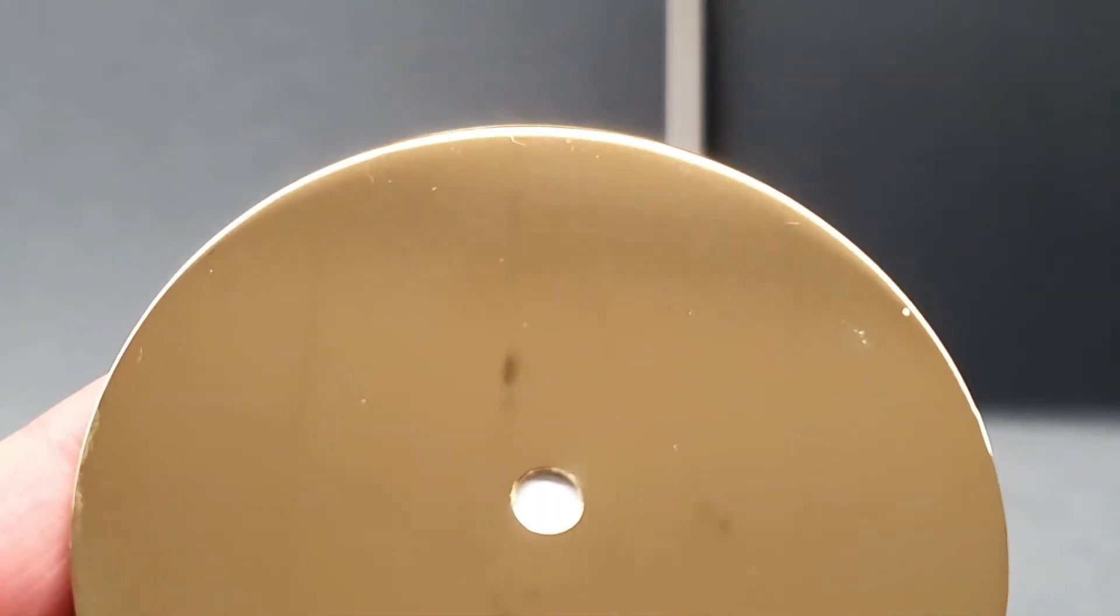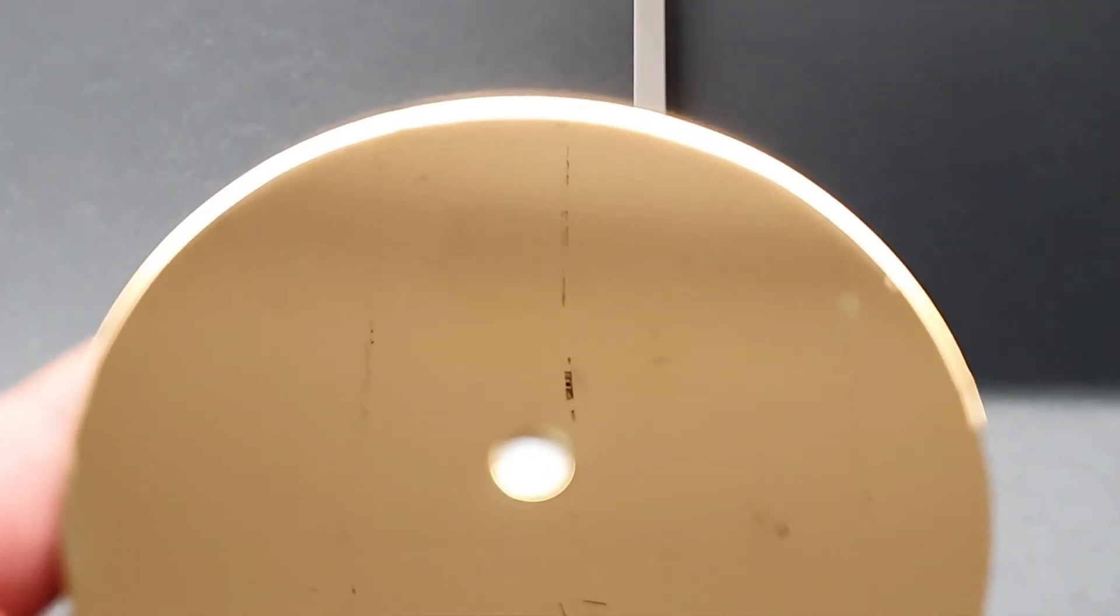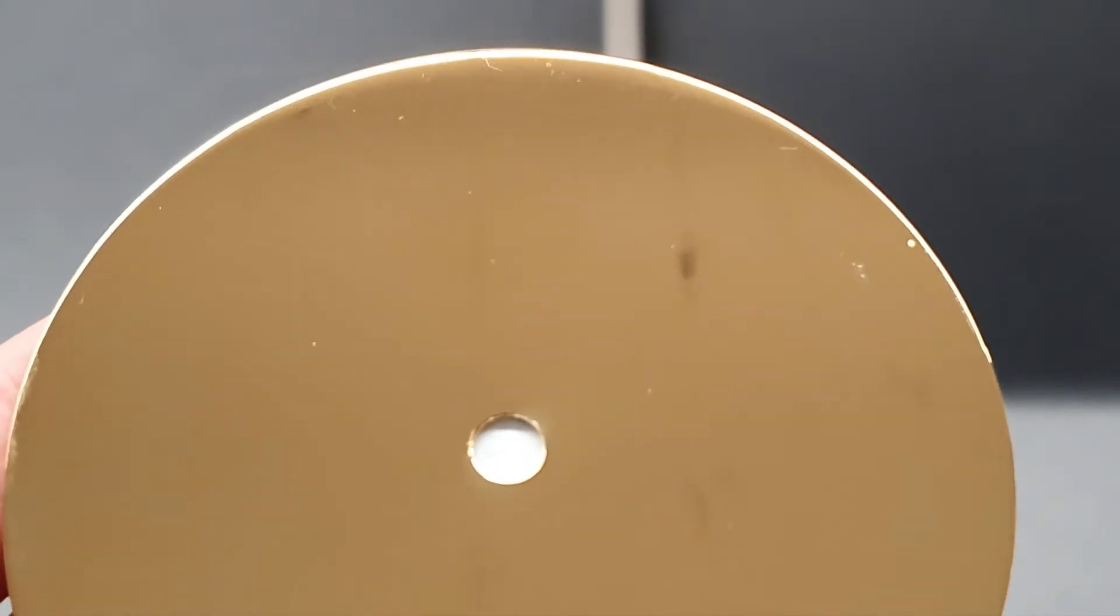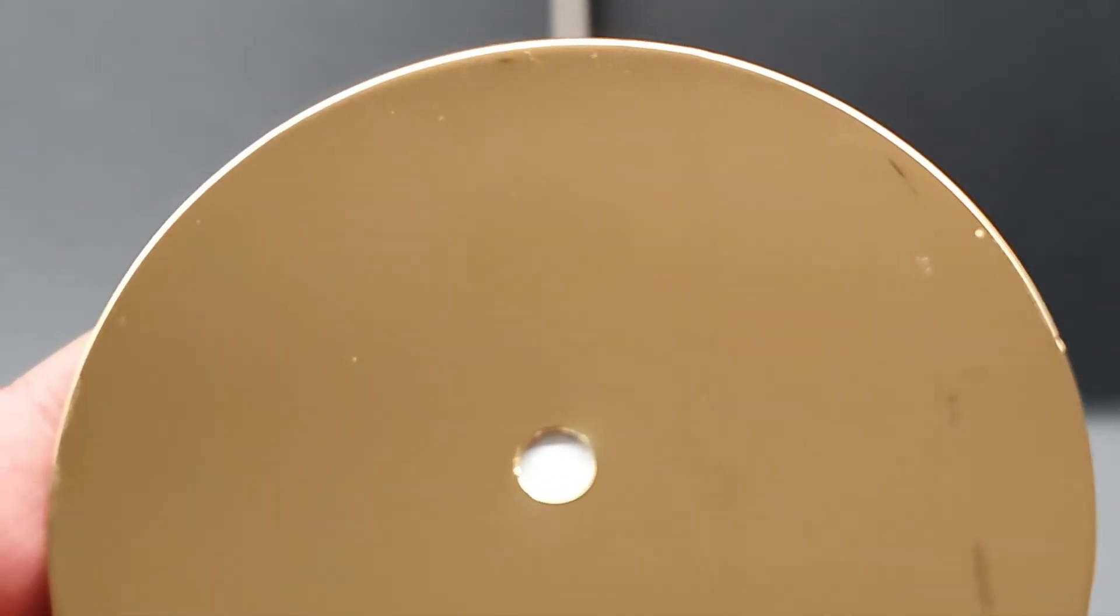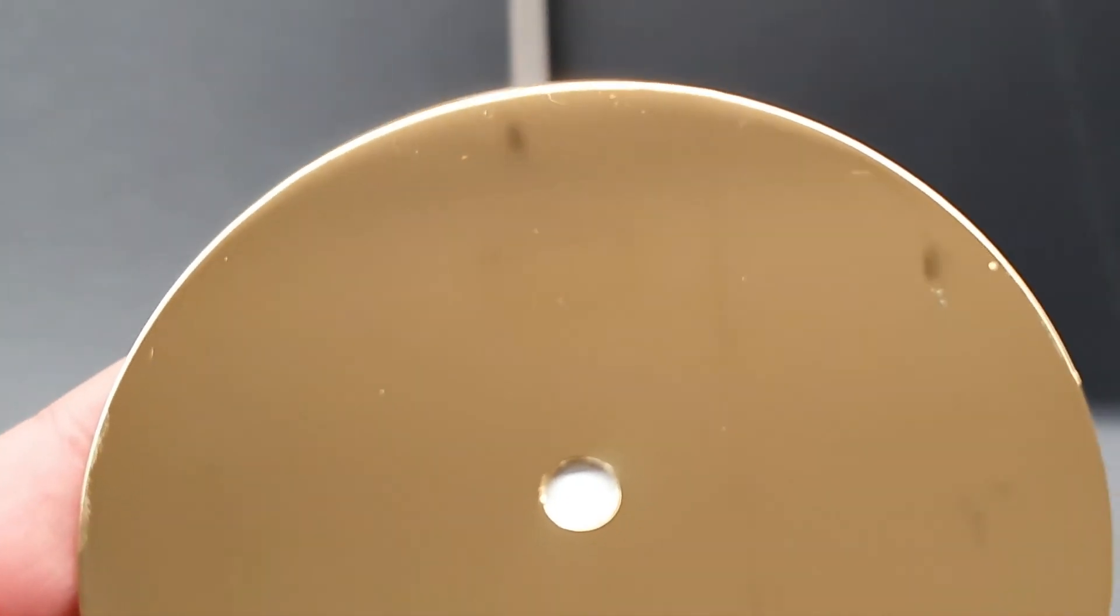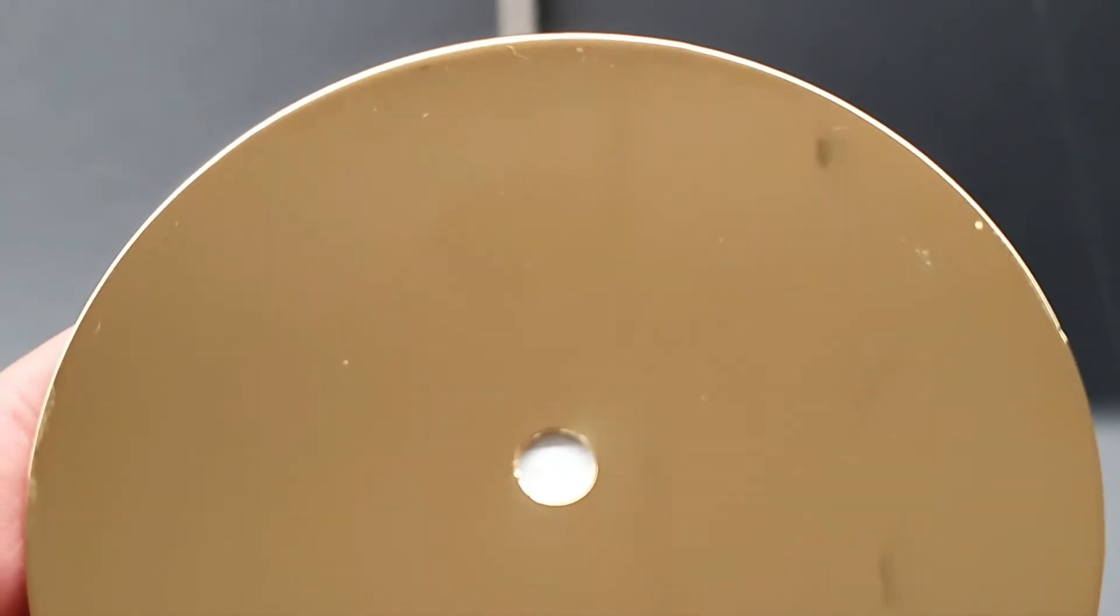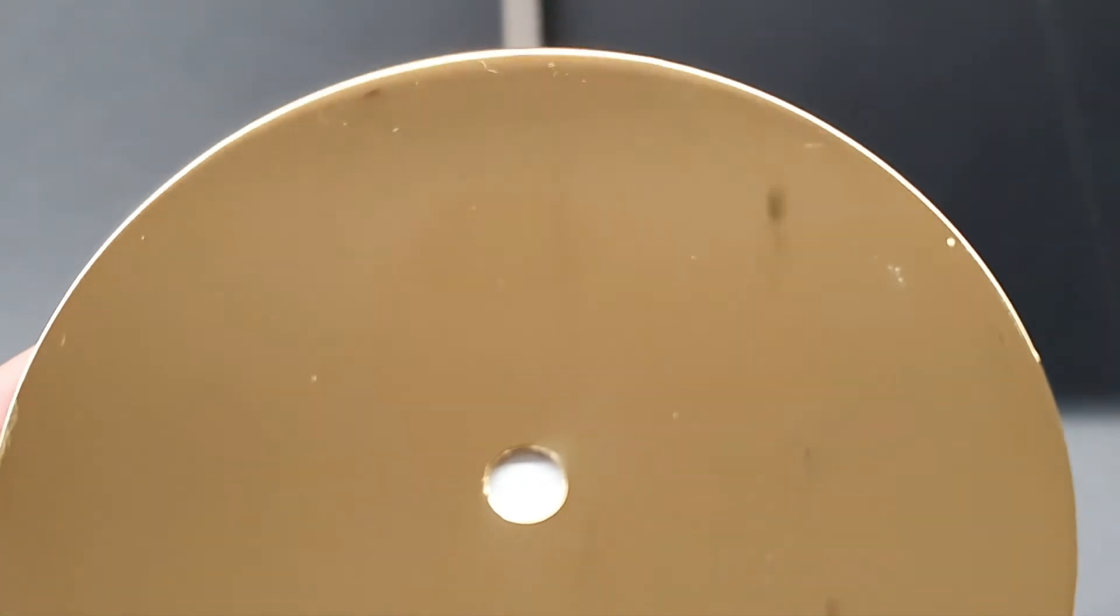As last we had the glossy gold PVD coating. You don't see any changes on the surface of this probe.